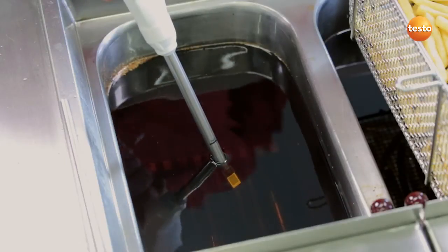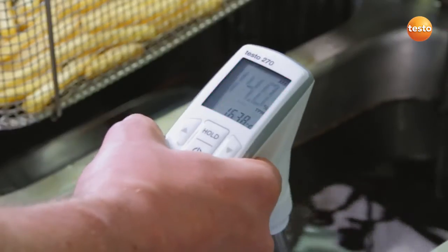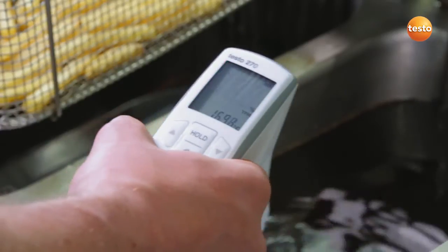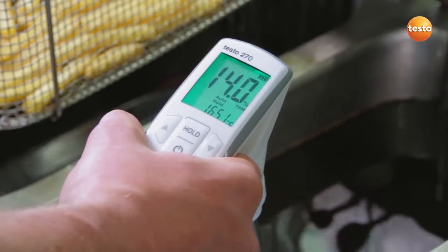In order to shorten the measurement time, I move the sensor in small circles in the oil. In the auto-hold mode, the display with the readings starts to flash. As soon as the measurement value is stable, the display freezes.